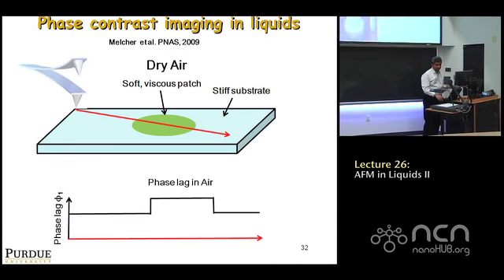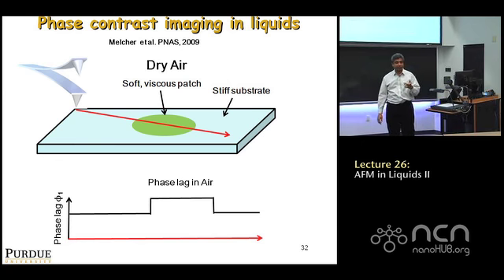Now we come back to the question that Francisco was asking regarding the difference between this ringing and energy dissipation. Remember, we derived a long time ago that the sine of the phase lag is connected to energy dissipation, correct? So that's the dissipation variable that you derived. That's even correct in liquids; that relationship is always correct. The question always is, what's the source of the energy dissipation?